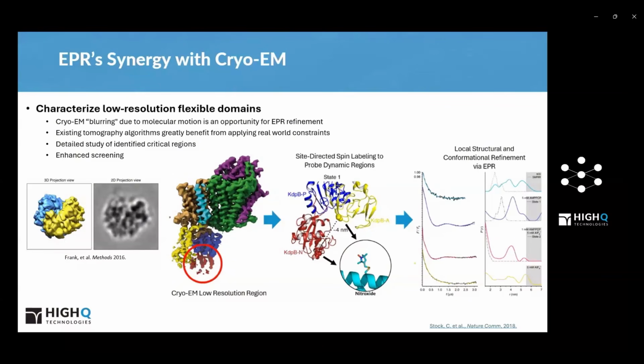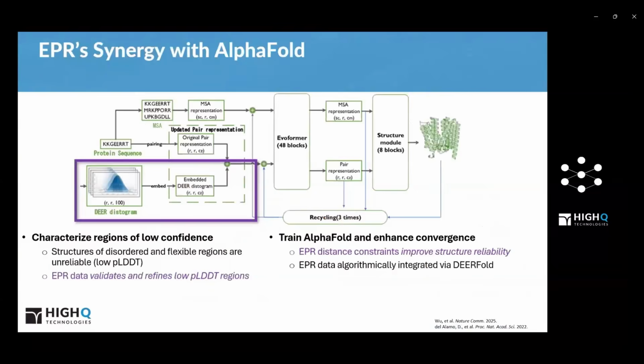And so what this is telling you is that EPR can be used, in conjunction with these structural models, to refine your understanding of the conformational shifts in response to various ligand binding, and to fill out your understanding of what conformational states actually exist when these ligands bind, when these functions actually occur. So this is a really nice example of how EPR can help supplement and complement great structural data.